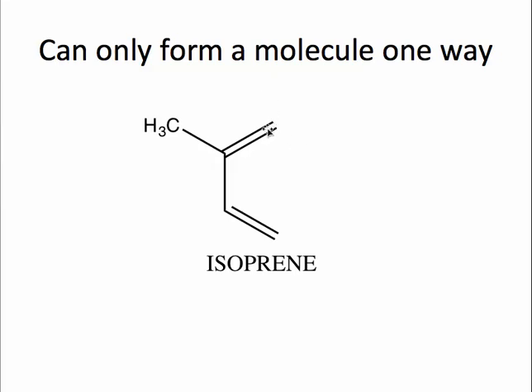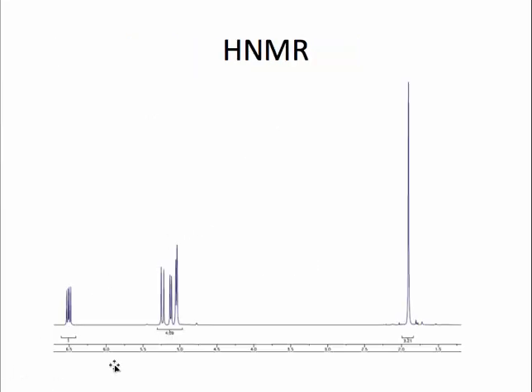This hydrogen that's cis to the methyl group will have a slightly different shift than this hydrogen that is cis to the alkene group, and they'll actually couple to one another because they have different shifts. Likewise, that's going to happen here, and then there'll be further coupling here, and so all in all, we have a very complex array of peaks, but none that are going to interfere with our solving the structure.